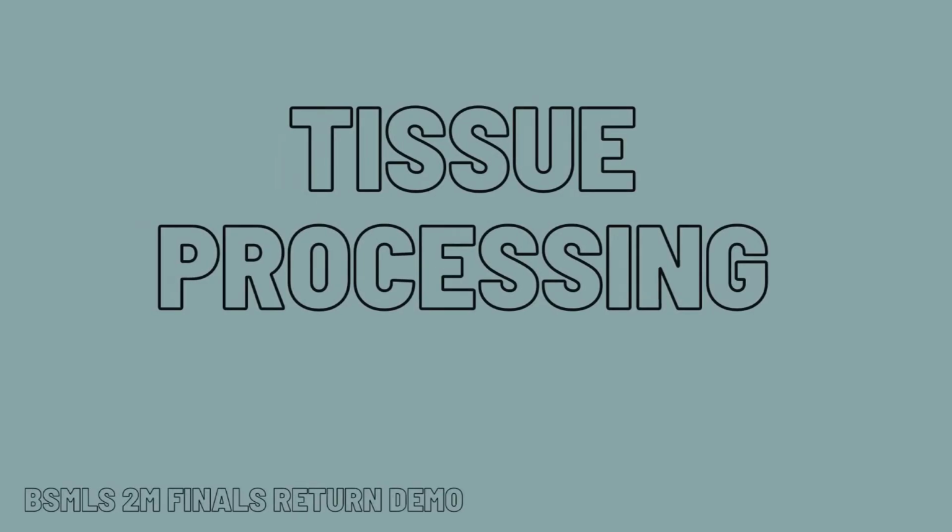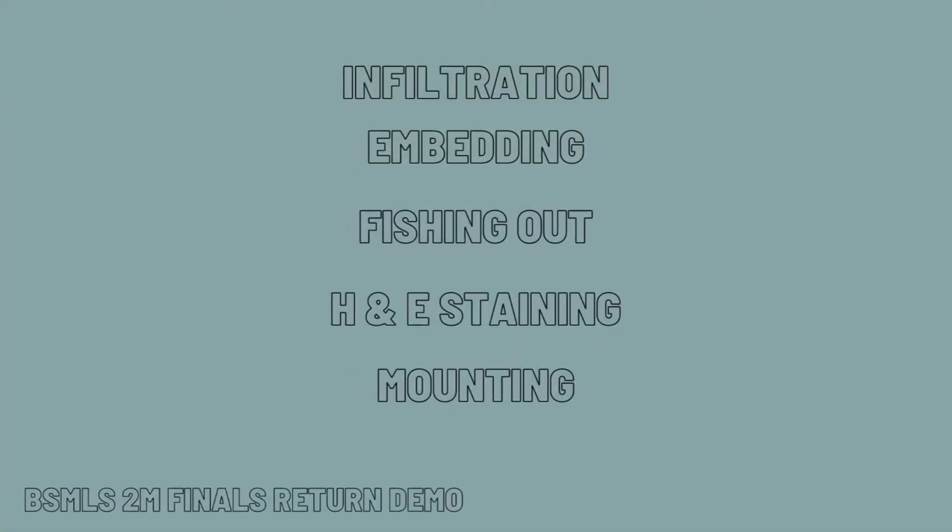Hello, good day. We are your histopathologists and histotechnicians for today, and we will be demonstrating the proper steps in performing some of the methods in tissue processing, of which are infiltration, embedding, fishing out, H&E staining, and mounting.